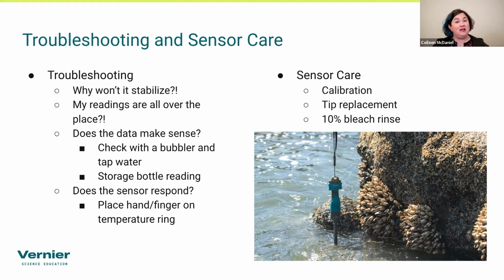In real extremes, I have found it can take 3 to 5 minutes before it really stabilizes. The closer you are to room temp or atmospheric temp, the less time it's going to take to stabilize, because remember, our sensors have this temperature aspect that they're constantly getting a reading from, helping correct the DO reading for the temperature.